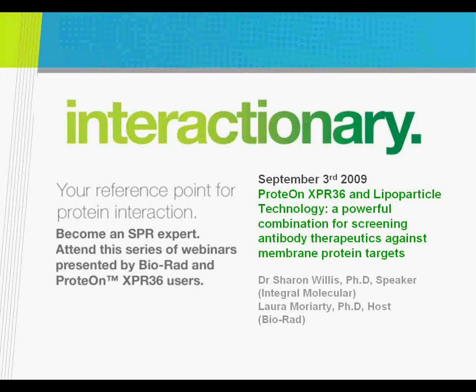I think 35 degrees was my highest temperature, and I was able to get fairly good data. Of course, at higher temperature any instrument starts to struggle no matter what. Your data don't look as good, but in the overall picture it's okay because it's still a screen. Yeah, I would say yes, it works quite well.